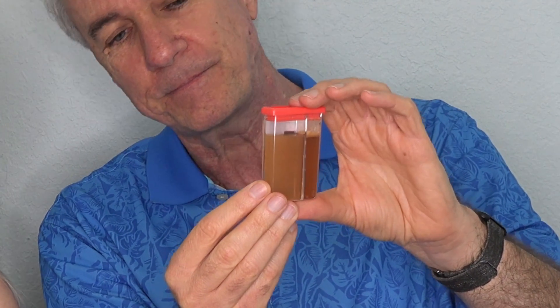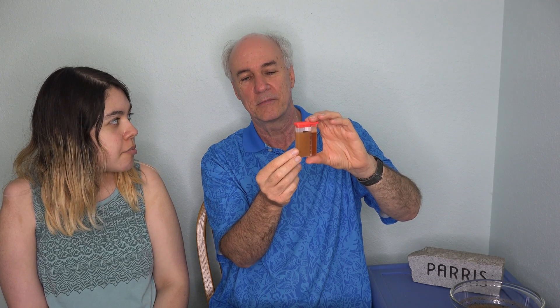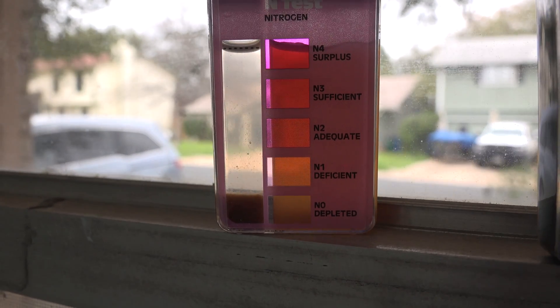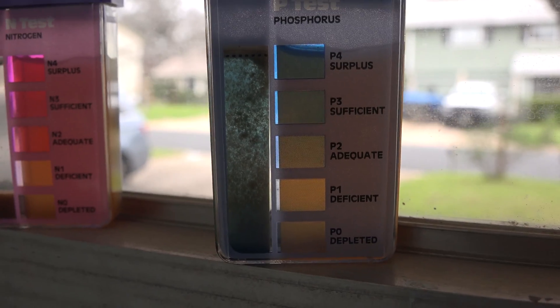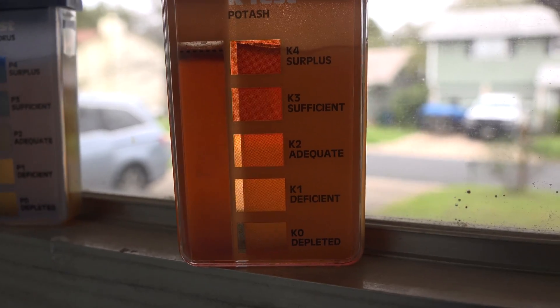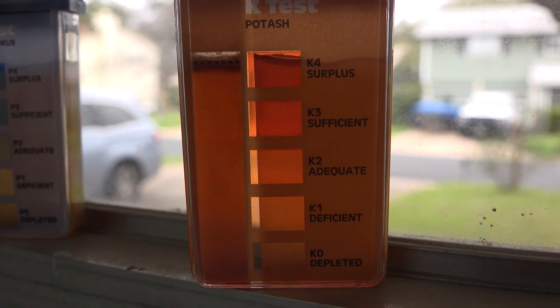The last one is potash. Definitely K2 or higher — so adequate or higher. Maybe K3. It feels like it could almost be surplus but not sure. I think it's between K2 and K3, so between adequate and sufficient — we're good on that. So it looks like nitrogen is the one I'm going to have to work on. Here's your own view of the nitrogen test chamber — on the left side that is clear, so it matches the very lowest one, depleted. Here's phosphorus — that's middle to the one above it, so we're in good shape. And potash — the color in the test chamber on the left we think is between the middle one and the one above that, so we're in good shape for potash as well.